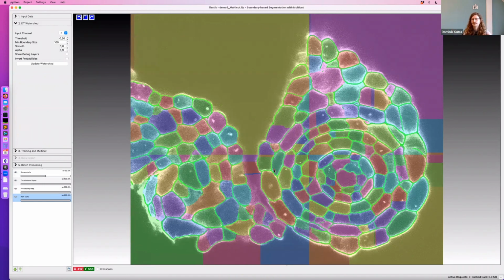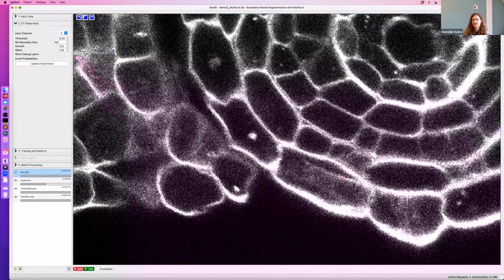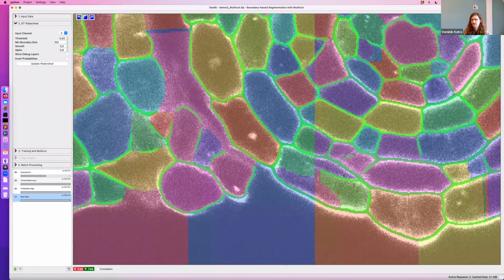Because in the end, what you are trying to do is assign pixels to form objects. And of course, there are many pixels even in such a small image like this. But to make this problem easier, we first have this step of the watershed that groups pixels together, with an approach that is not very smart, but it groups the pixels that can confidently be merged into larger chunks together very well. So you can see, for example, this here is probably a single object, but it is in multiple parts, and those parts were very easy to merge.